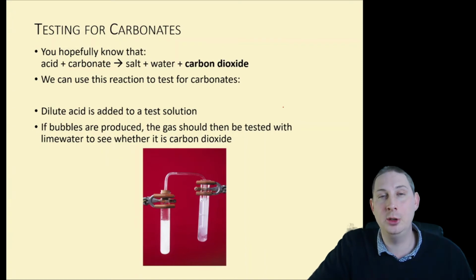Thank you very much, Mr. Reeves. That's my pleasure, Dr. Nixon. The very final test that you need to know for C8 is testing for carbonates.